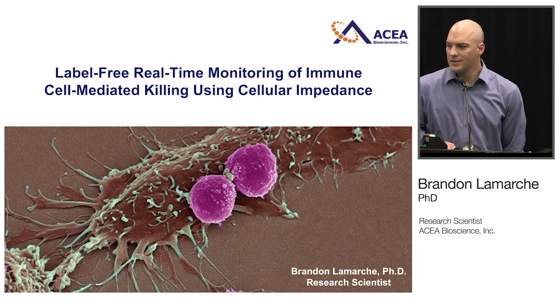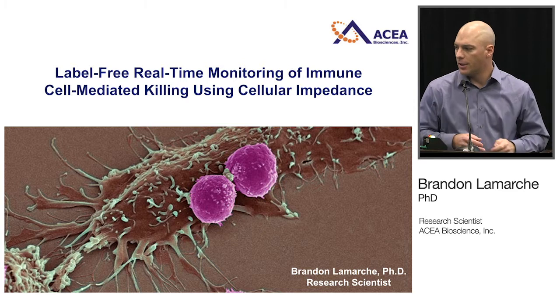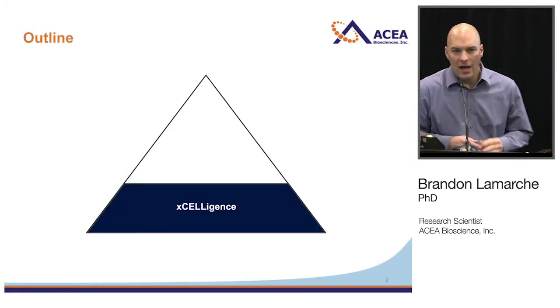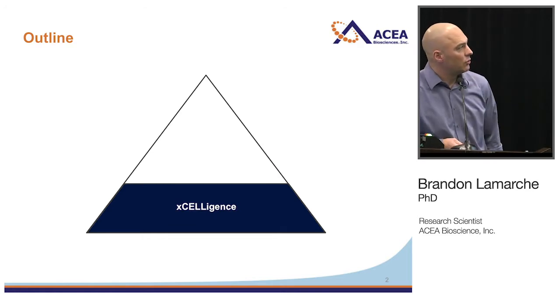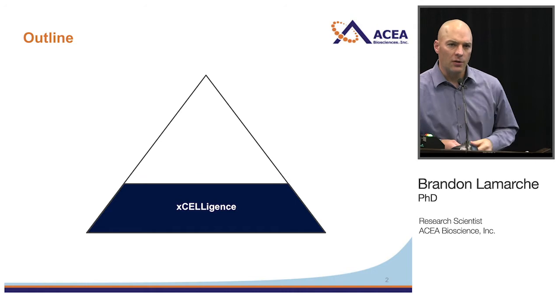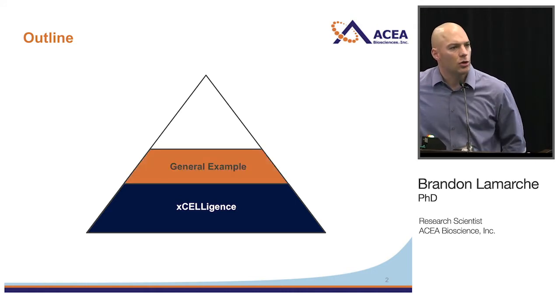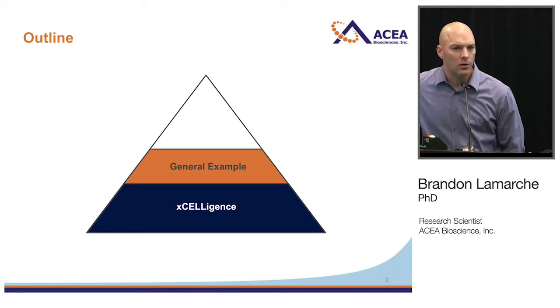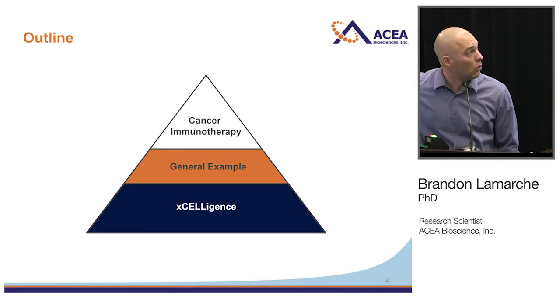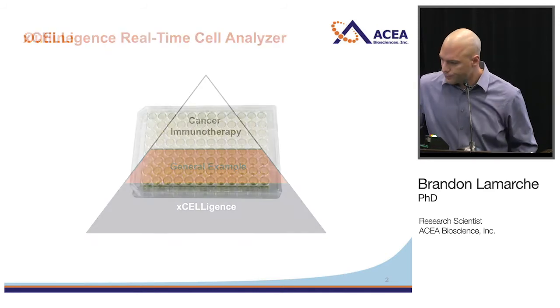The title of my talk is Label-Free Real-Time Monitoring of Immune Cell-Mediated Killing Using Cellular Impedance. A quick outline for my talk. I'm going to speak extensively about the xCELLigence technology, explaining how this works. And then from there, I'll give a general example showing you what the data that's generated by this technology looks like. And then collectively, these will serve as a foundation for actually looking at cancer immunotherapy applications.